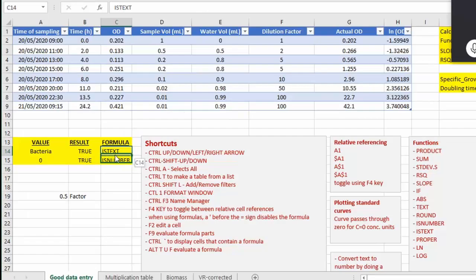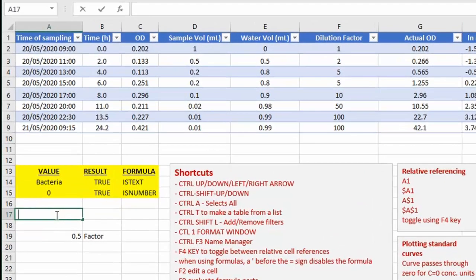These two are really good because sometimes, let's say if I enter a value and I put a space, because some people do, and then they put in, let's say, number 3. So if I ask what the length is of that, it says it's 1, or you can have, let's say, text space.